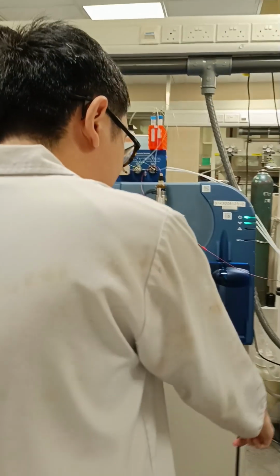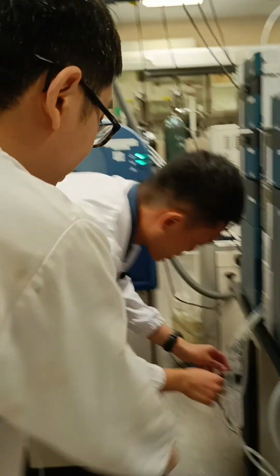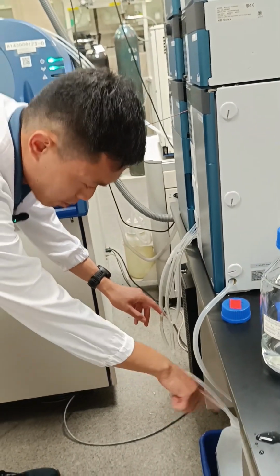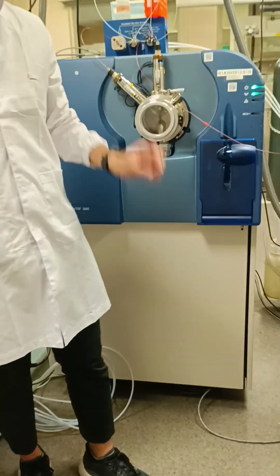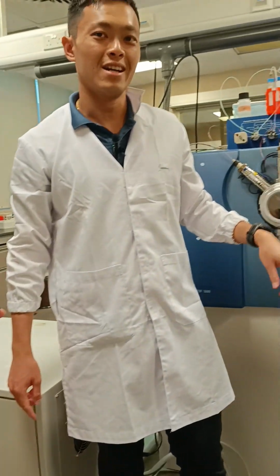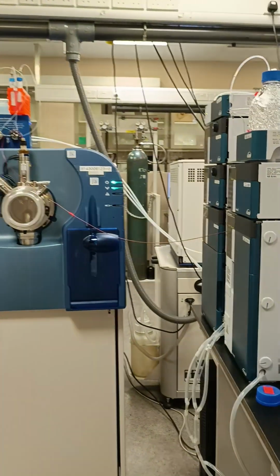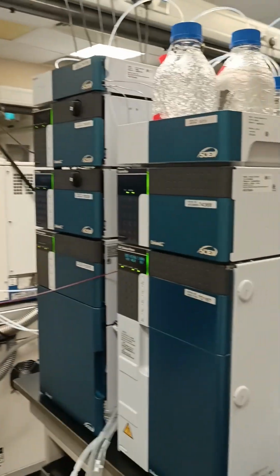Usually I just insert it into this hole here. So this is the waste bottle. Always remember, this is the first thing you should do. Otherwise, once the MS machine gets a problem, then it's another headache.